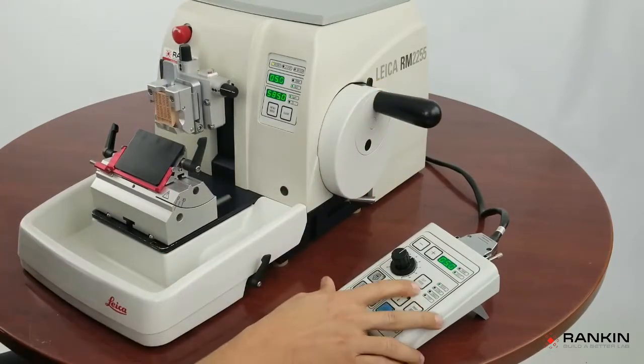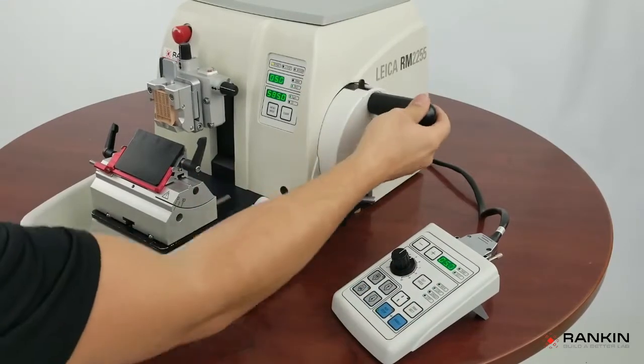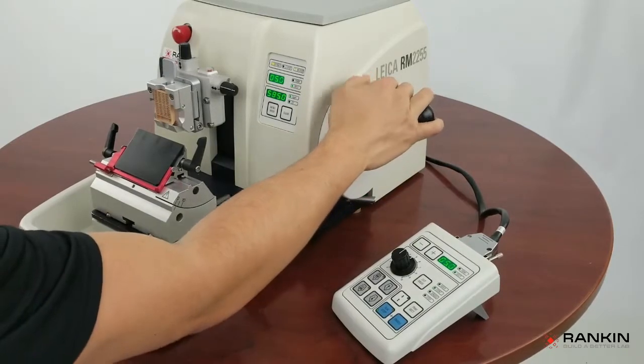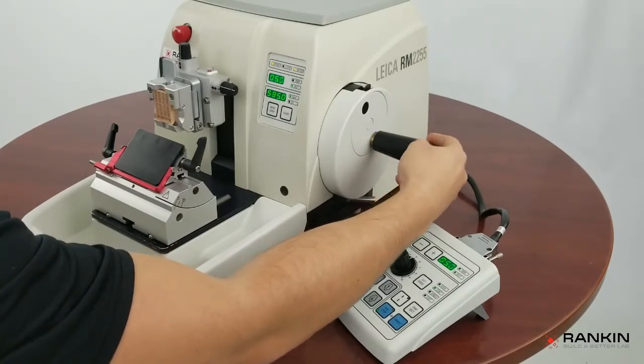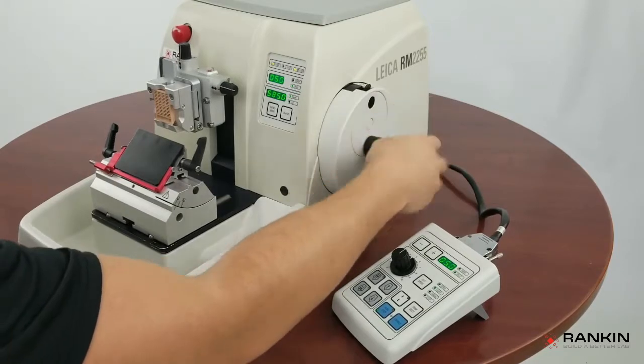The next mode is continuous, and this is an automatic mode. In order to get this into continuous function, I'm going to lock this, and then you pull the handwheel — the hand knob — out, and it will lock into the center position. Just spin it around and it will lock.